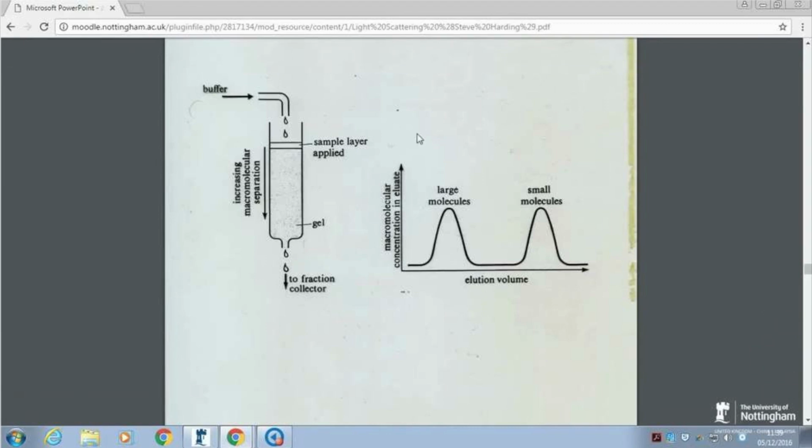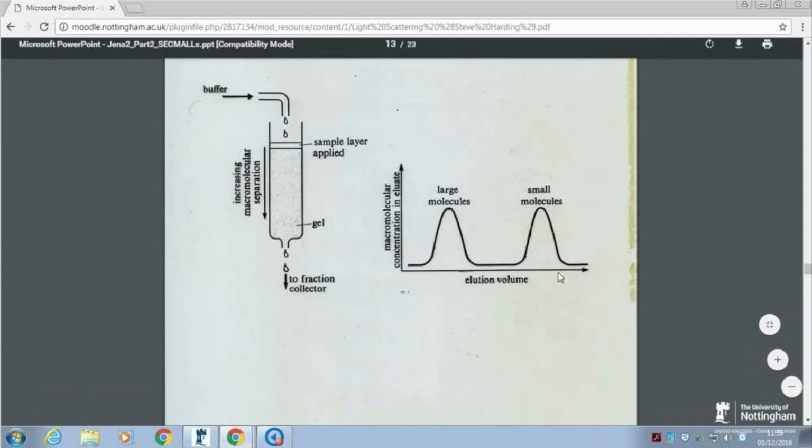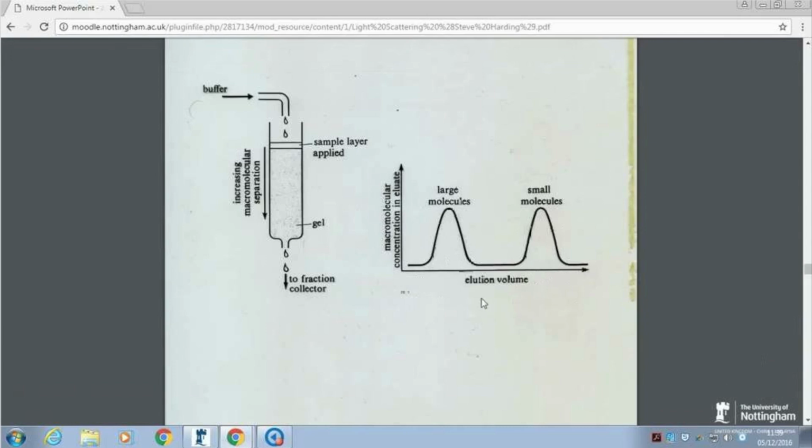By the way, if you were using chromatography by itself, how would you know the protein is coming off at these particular points? What detector would you use to show where your protein is, or what's the other concentration detector we talked about? A refractometer. Yeah. So you use a refractometer or a spectrophotometer online.